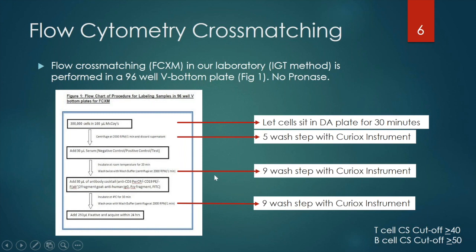And it's the same wash buffer we would be using here. And the incubation time is also the same. But at the time of washing, I do a 9-step wash with the Curiox instrument. Antibody cocktail addition is the same. Incubation is at 4 degrees for 30 minutes.